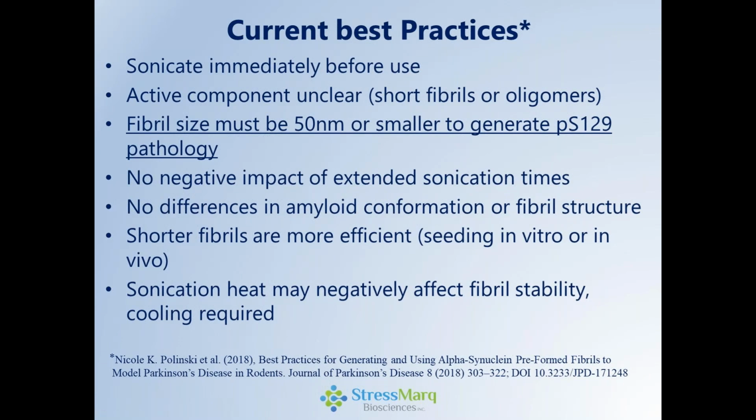Let's have a look at the current best practices. These are largely described in the literature associated with the citation given at the bottom, provided by the Michael J. Fox Foundation. There is a requirement to sonicate the PFFs directly before use. The active component itself is unclear, whether they're shorter fibrils or oligomers. However, it is given that the fibril size should be 50 nanometers or smaller to generate the phosphoserine 129 pathology.